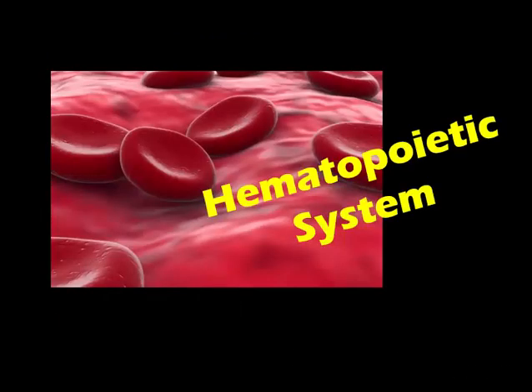First, let's talk with a few general comments about the hematopoietic system of mice. A couple things that you need to know about mice. In terms of circulating leukocytes, about 75% are going to be lymphocytes. There is some gender diversity in terms of granulocyte counts, with male mice having significantly higher counts of granulocytes in the peripheral blood. And when you look at granulocytes in tissue, they often have a ring-shaped, or I call donut-shaped, nuclei.